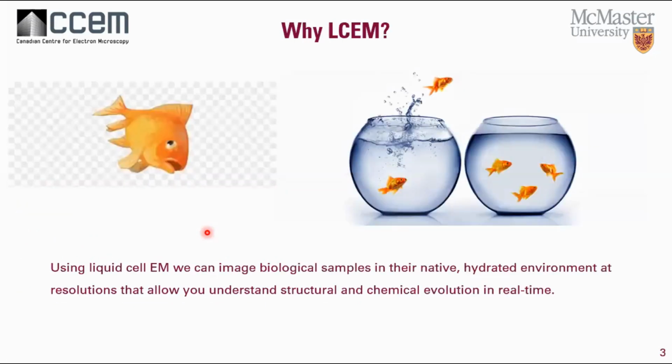So why shall we use liquid cell microscopy? Traditionally, TEM requires the sample to be vacuum stable inside of the microscope. Most of the samples prepared for TEM are dried or embedded in a resin or epoxy, or sometimes they are flash frozen. All these methods have the potential to introduce artifacts in the preparation processes.